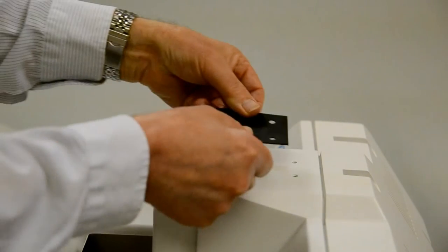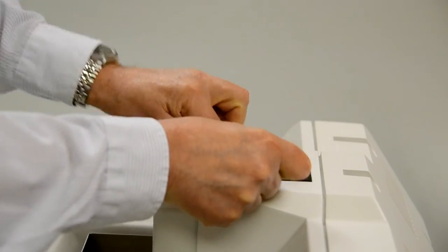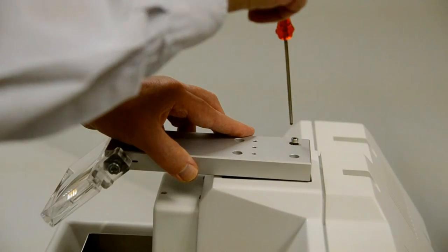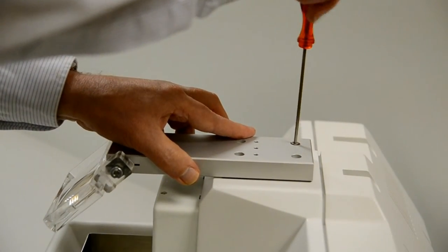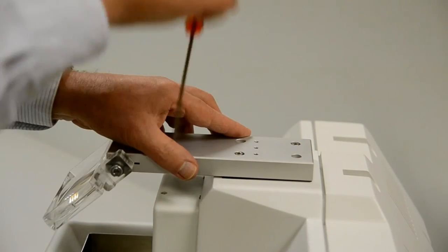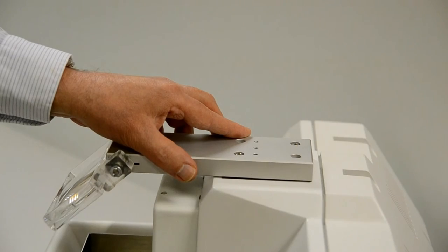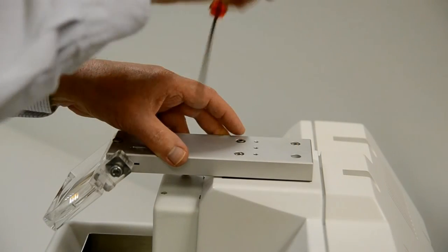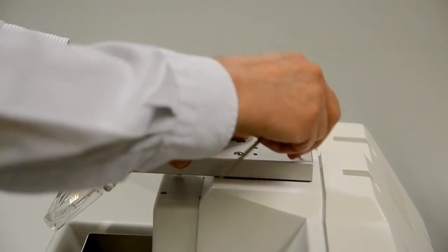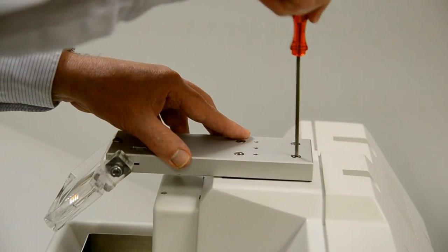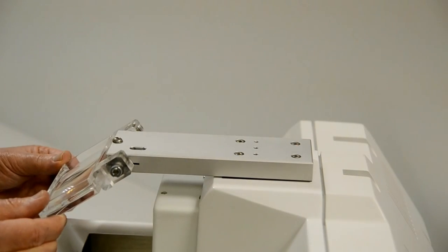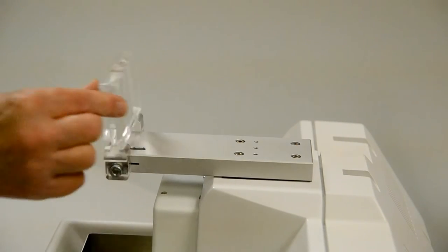A specially designed magnifying lens and mount is available that will give two times magnification. The magnifier is secured to the top of the instrument cover using the supplied neoprene cushioning pad and screws. The magnifying lens can be flipped up for easy access or moved to give optimum viewing of the tissue and cutting process.